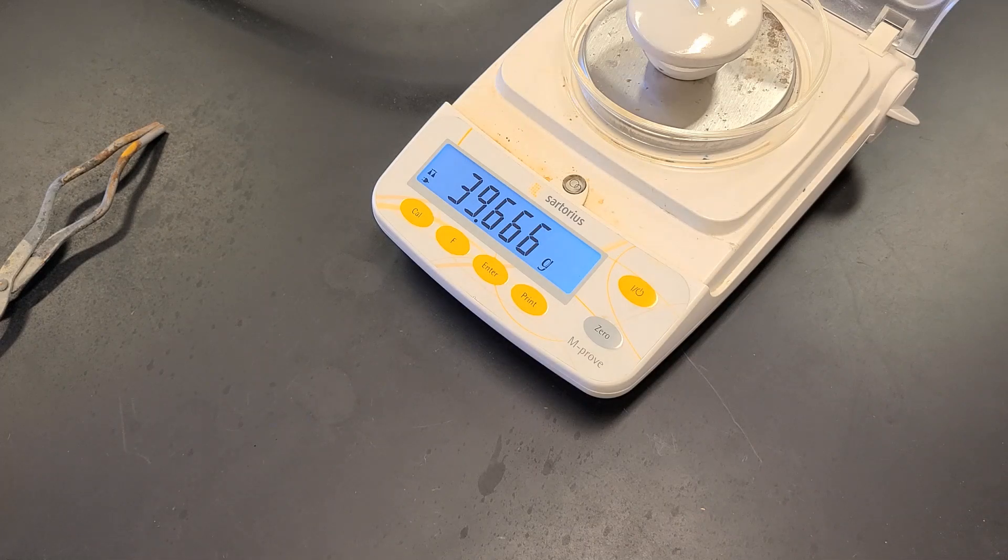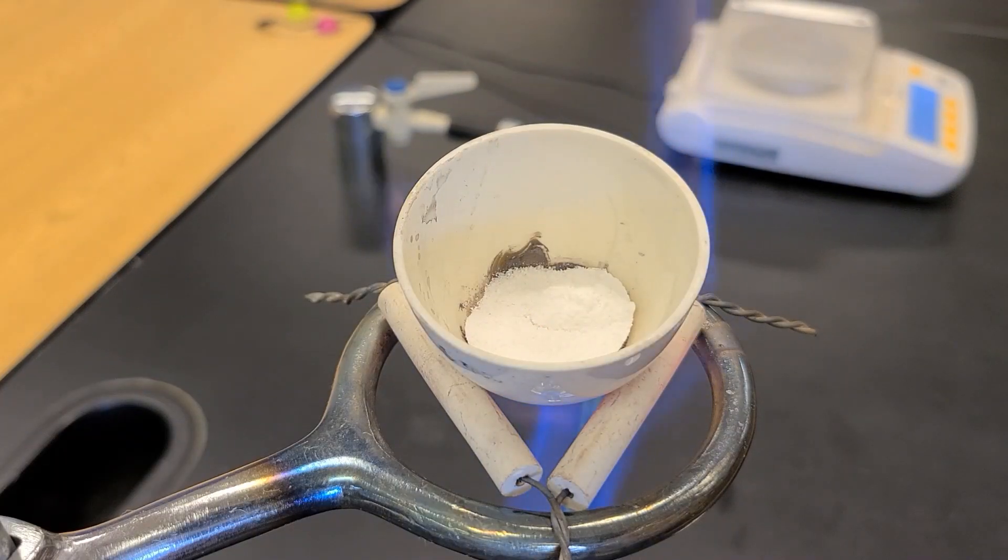Now that we have this mass, we're going to strongly heat for a second round. This time you can see what the sample looks like.